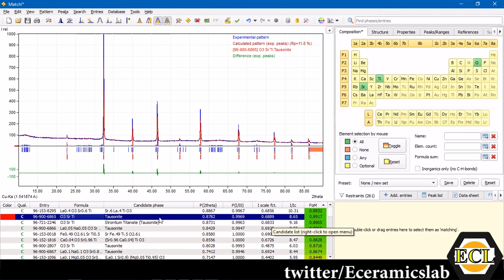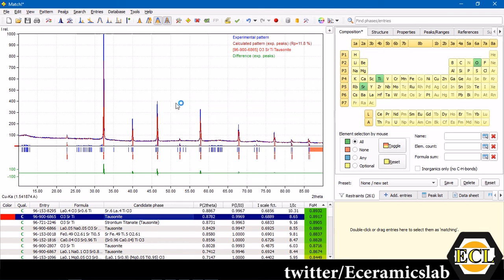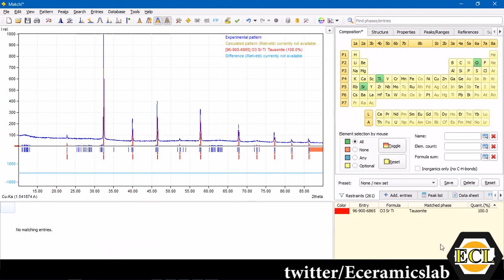To select this as the candidate which is matching with your powder diffraction data, you have to right click over it and click select as match or you can press space in windows. If you do that, it will come, that entry will come down to this one, the selected entry.